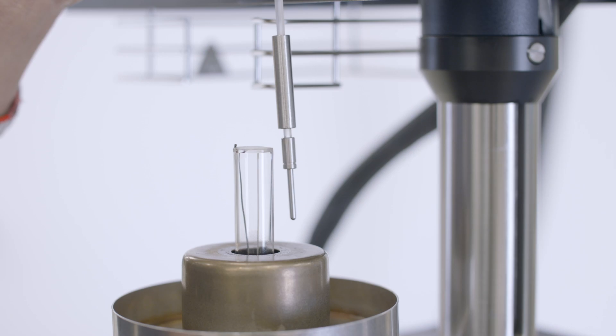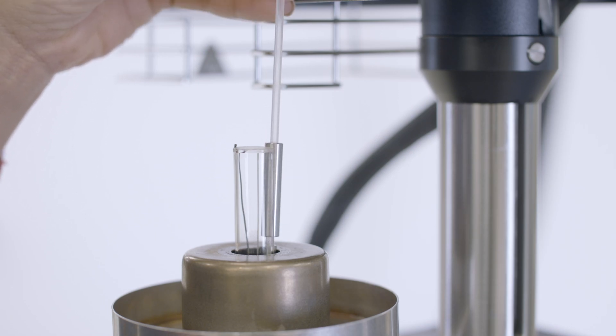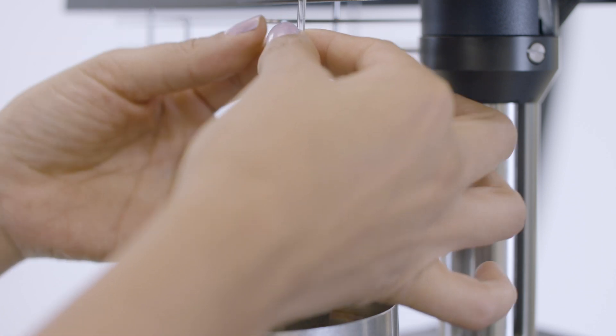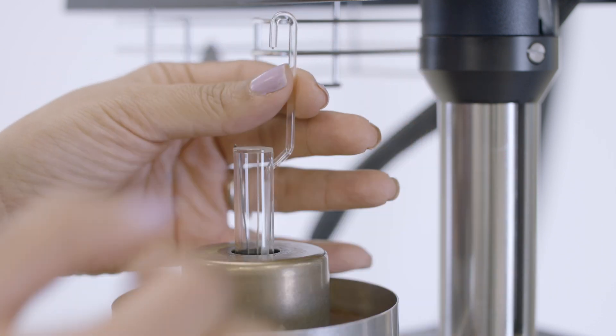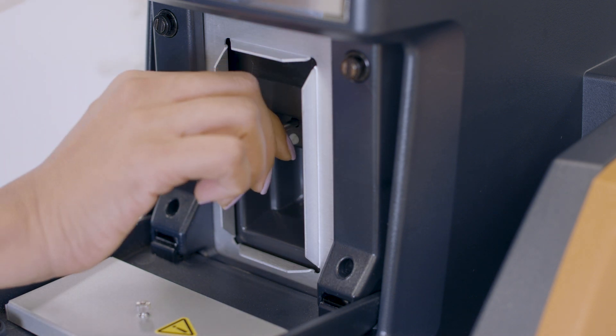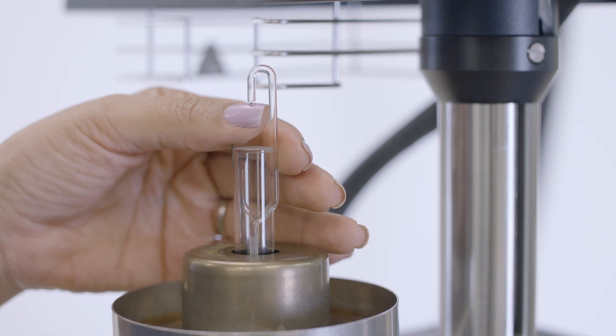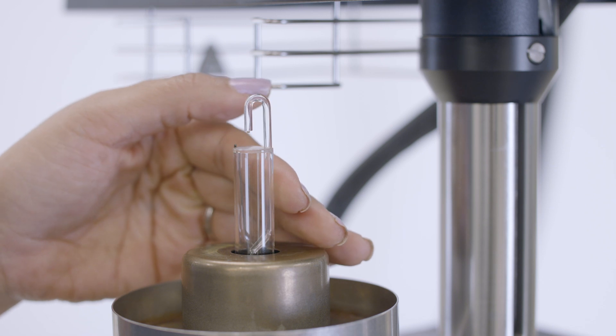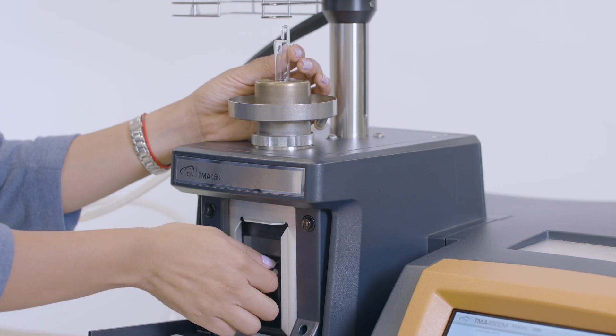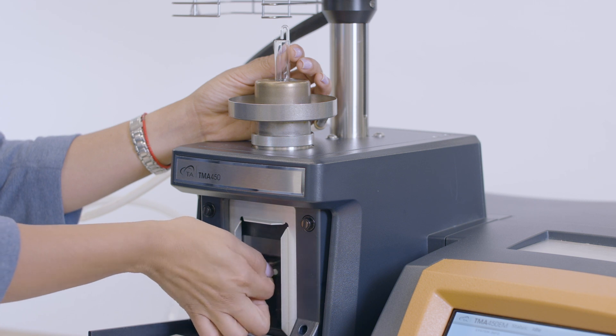The probe to be installed is the penetration probe. Insert the end of the probe into the opening in the back of the stage. Hold the probe locking lever in the up position and continue lowering the probe into the stage until you feel it sits in the locking mechanism. Tighten the probe locking lever by turning it clockwise.